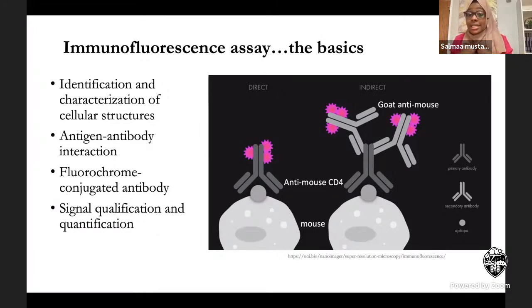And then what I did essentially is that I chose the brightness level that I wanted for my signal. So if there's anything that's not as bright as that, I neglect it, to help reduce potential autofluorescence from dead cells or proteins from dead cells. Yes, so that's what I did.